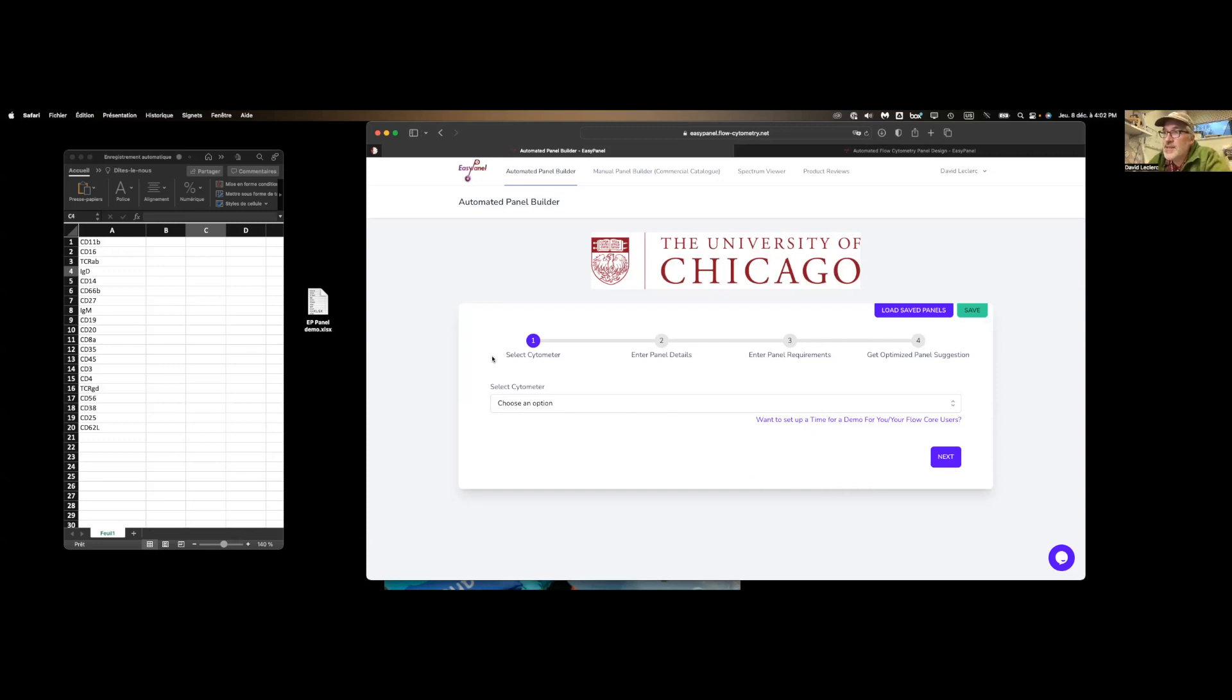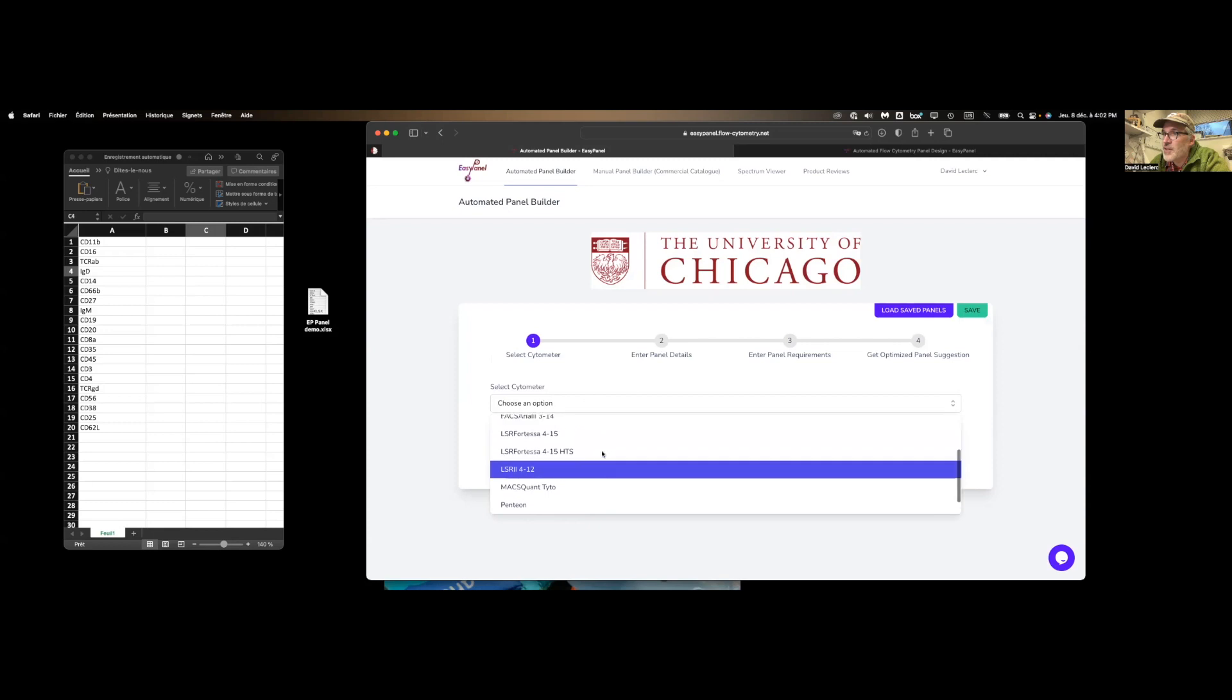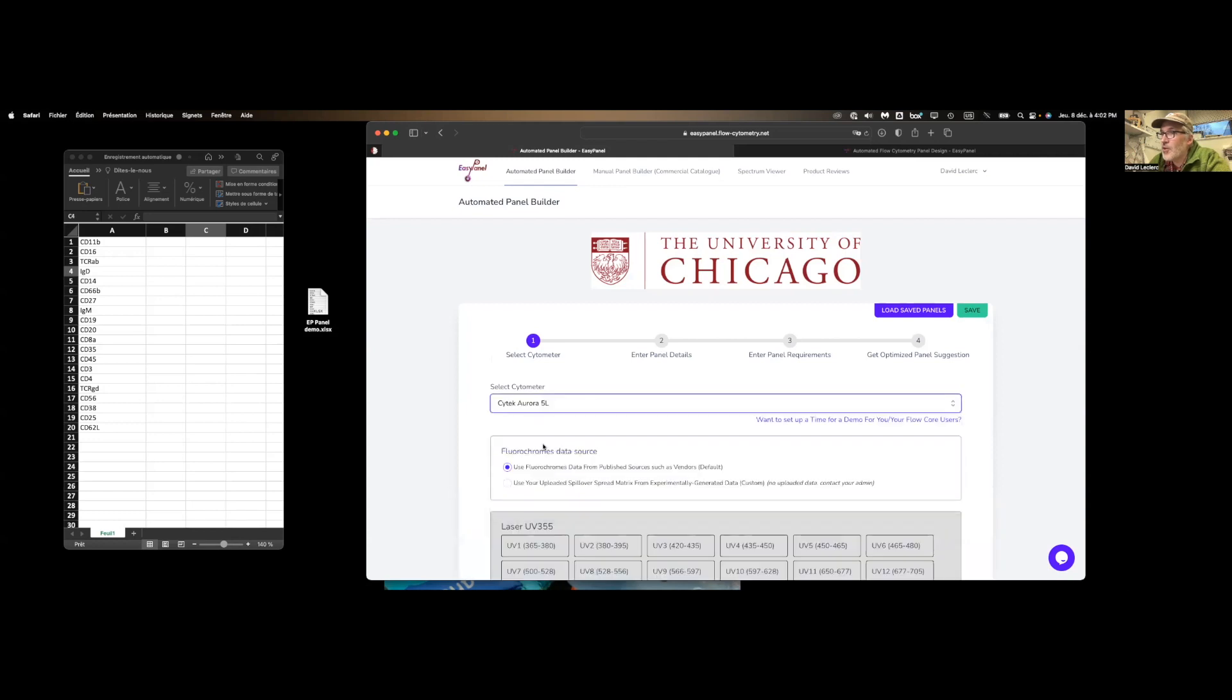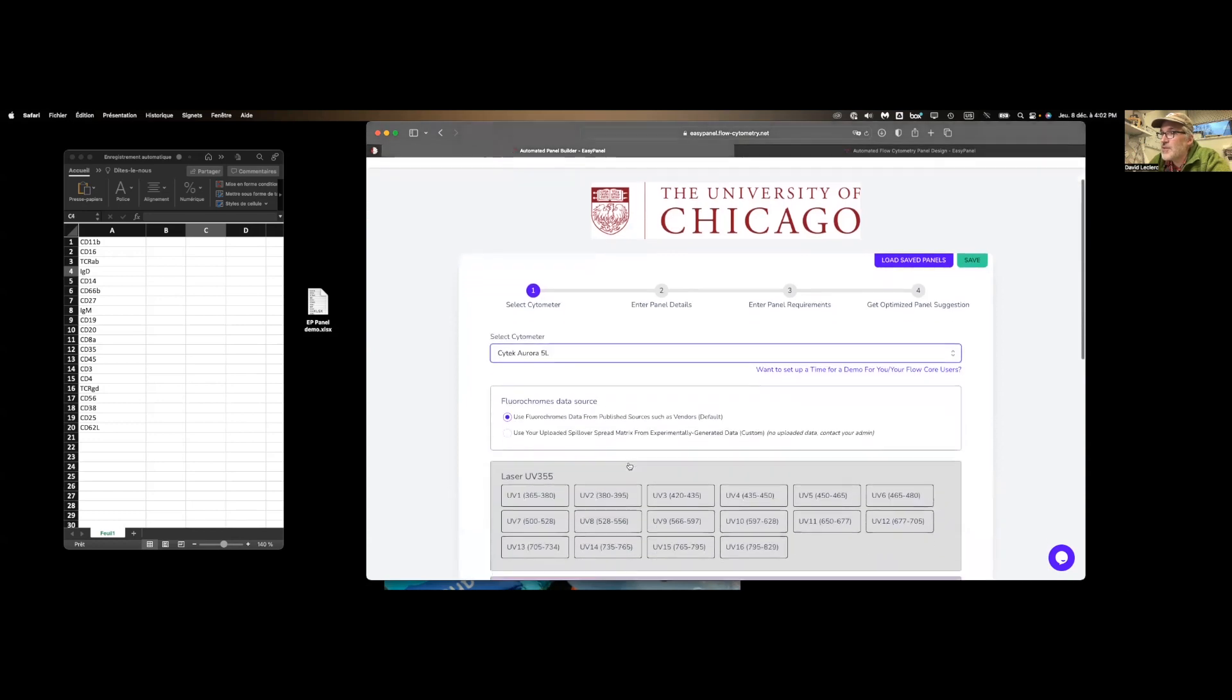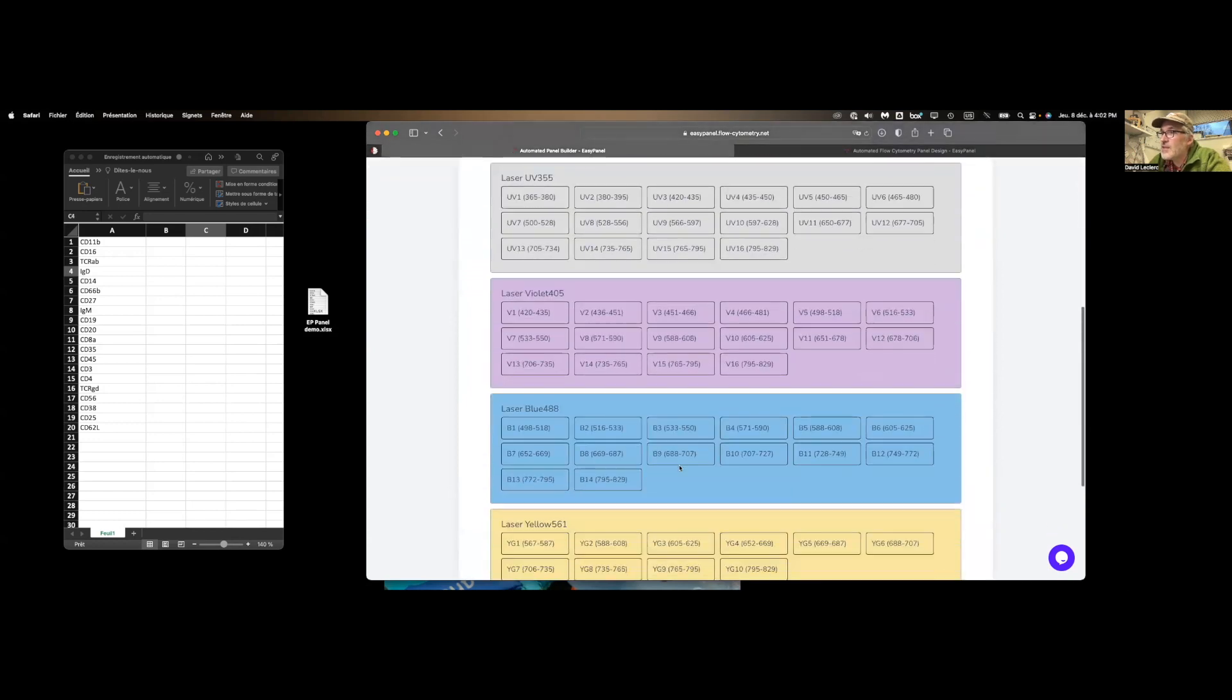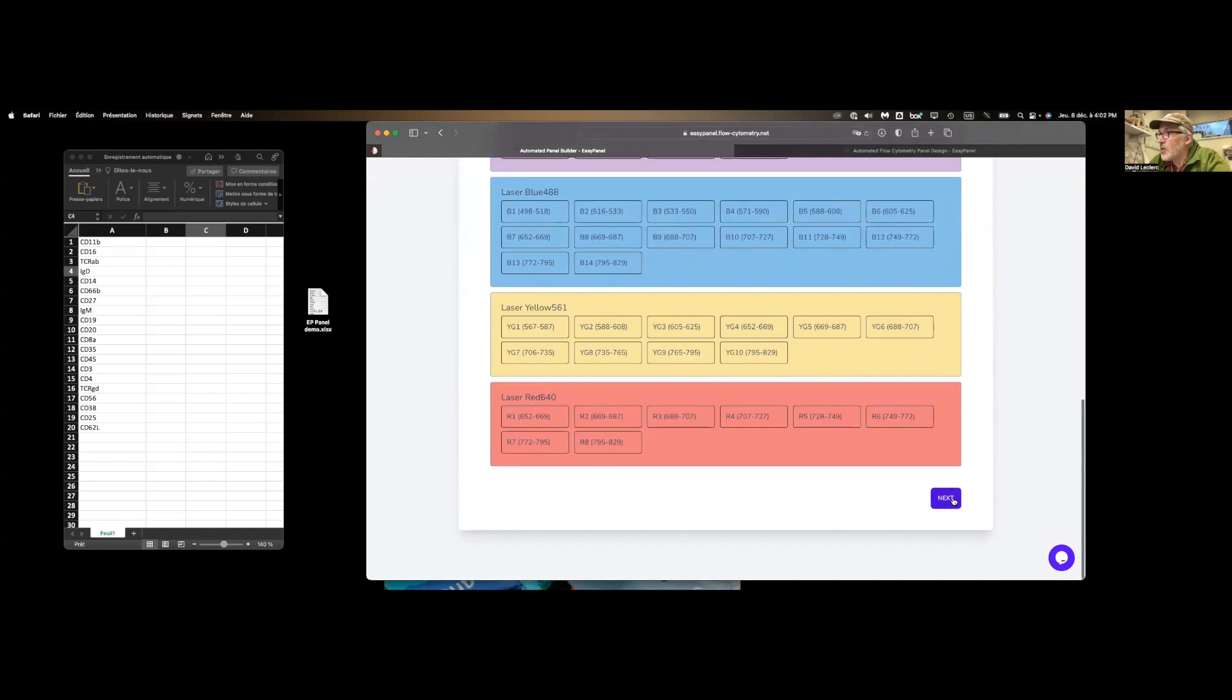So the first step is selecting the right instrument. So we have an account with EasyPanel. If you click on select cytometer, you'll find all the instruments available in our facility. So let's assume we're going to do spectral flow using our Aurora 5 lasers. So now we see a list of detectors available on this particular instrument. Click on next.